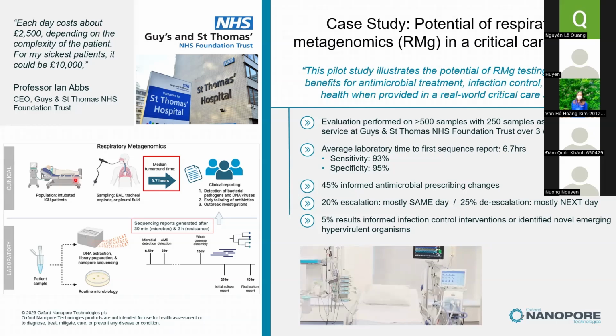In terms of barcodes, you can multiplex 24 or 96, and there's even a publication that was published last year in 2023. It is an article describing how they barcoded 100K specimens in one single nanopore run. They do a kind of dual index to increase the barcoding multiplexing capability. So a lot of things can be done on this platform.